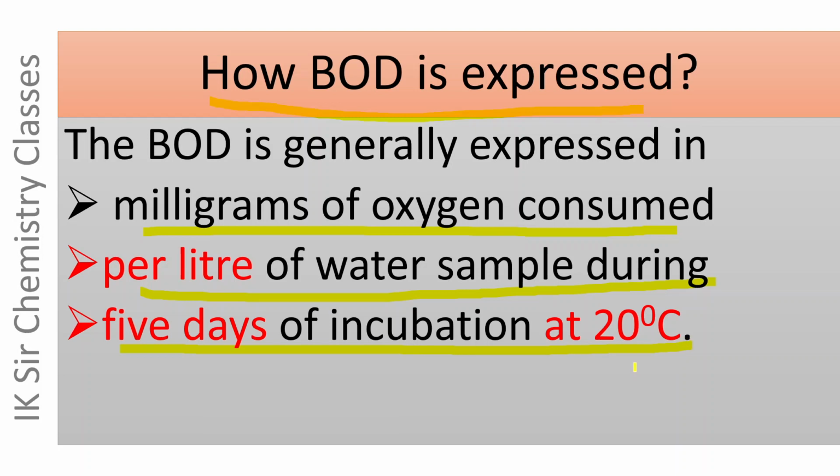The temperature should be 20 degrees centigrade. The time span should be 5 days. The volume of water body should be in liter, and the amount of oxygen consumed should be in milligrams.